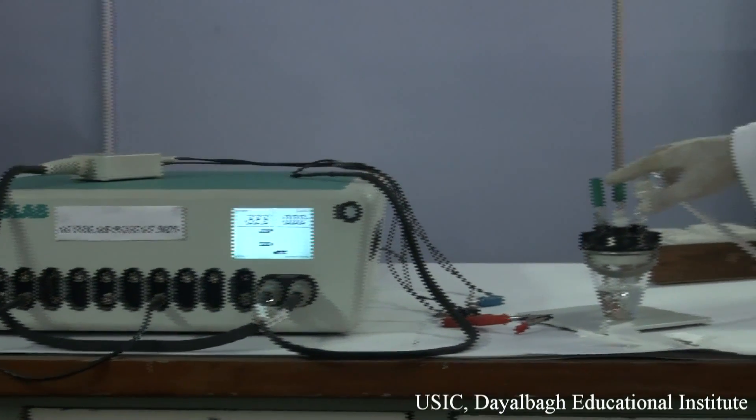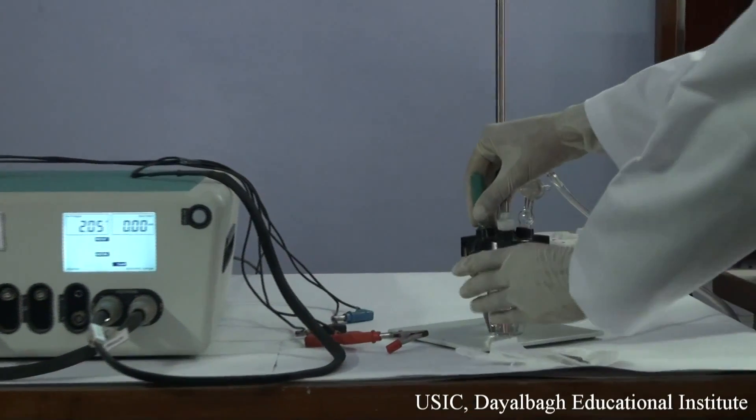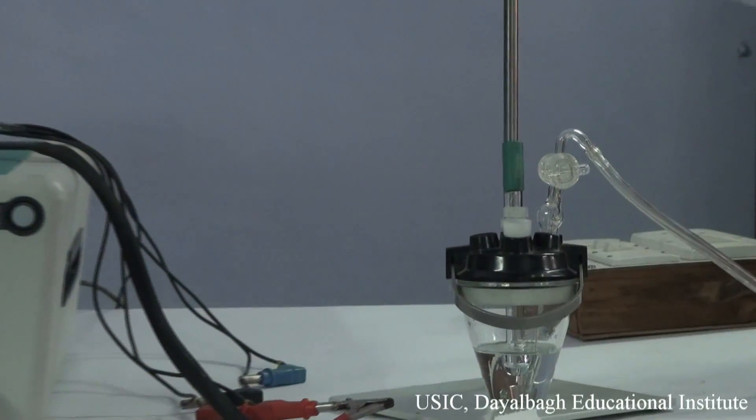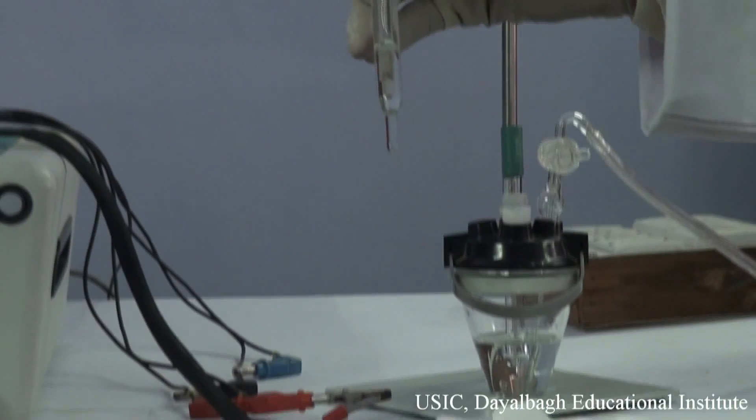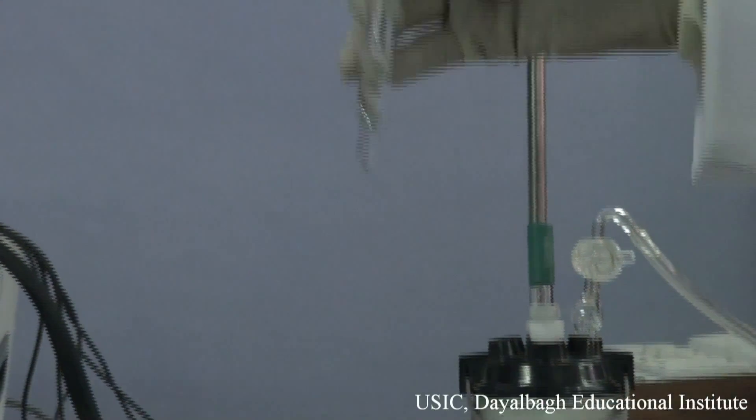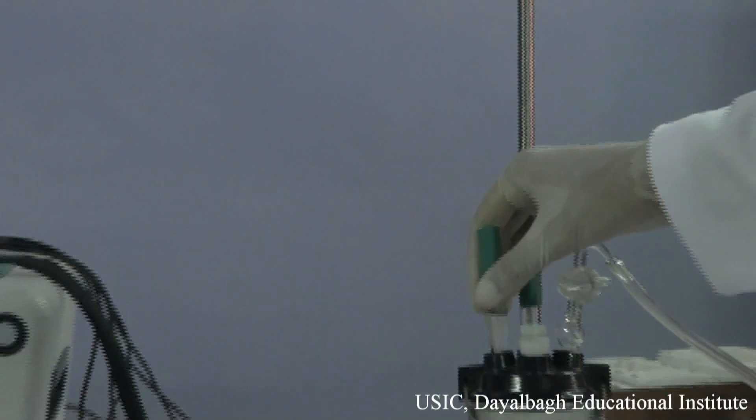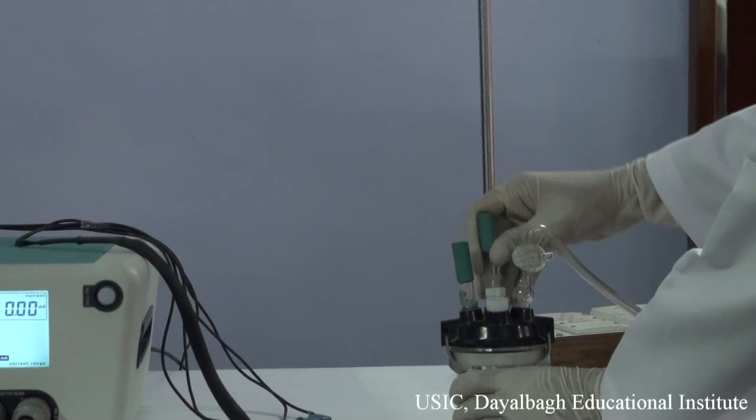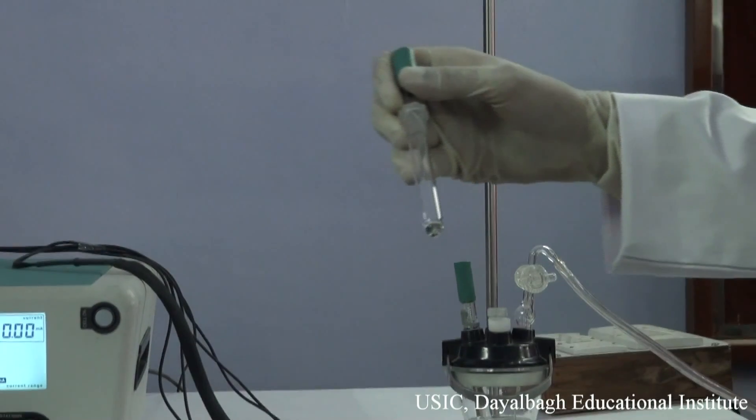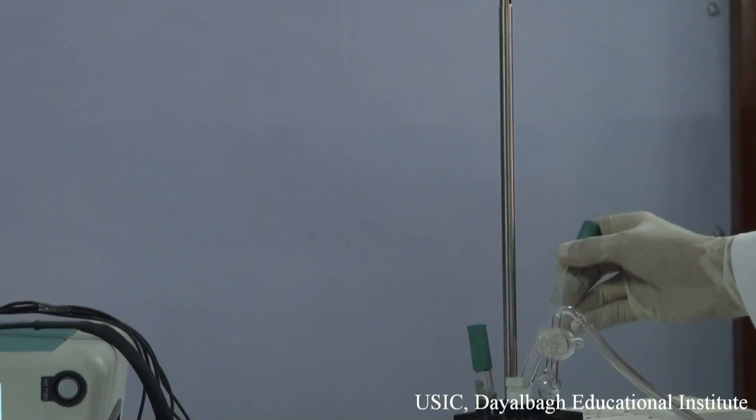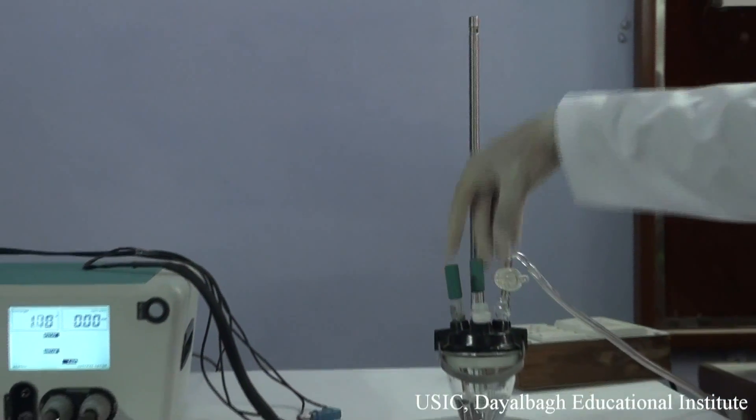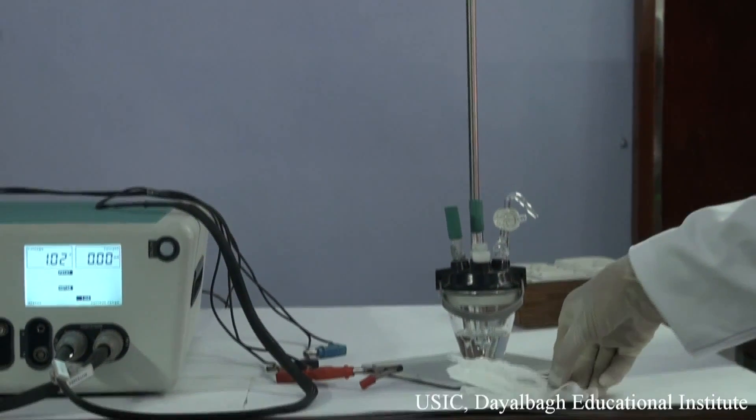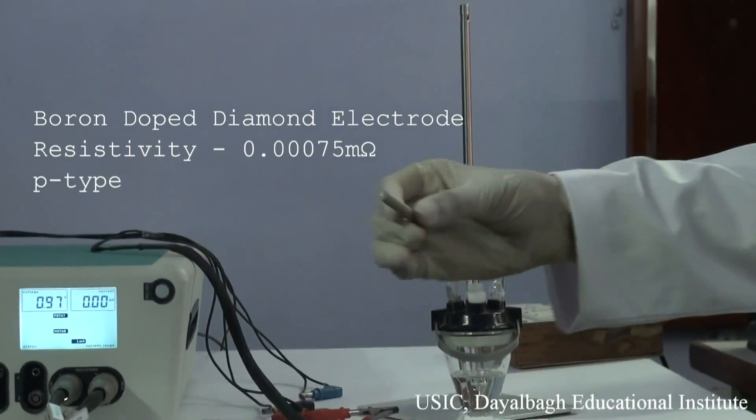Now, this is the three electrode system. This is the reference electrode, the silver-silver chloride electrode. This one is the counter electrode, the platinum wire. And the working electrode which we are using is boron-doped diamond electrode.